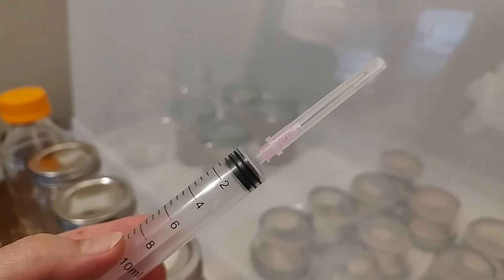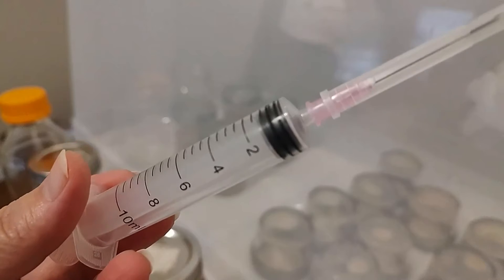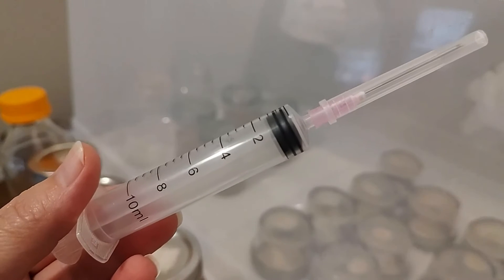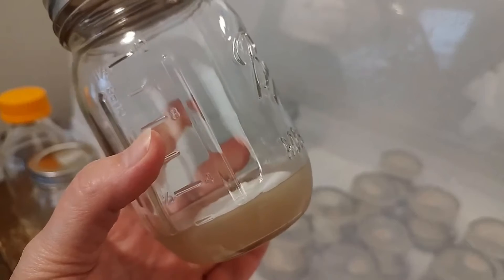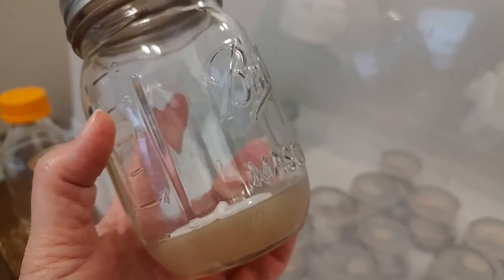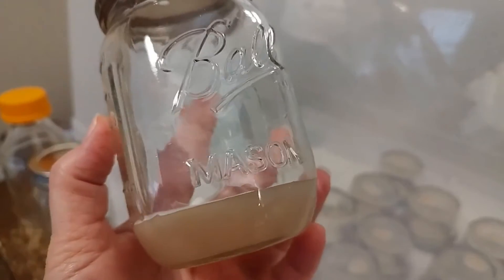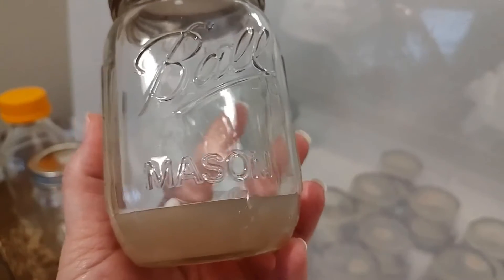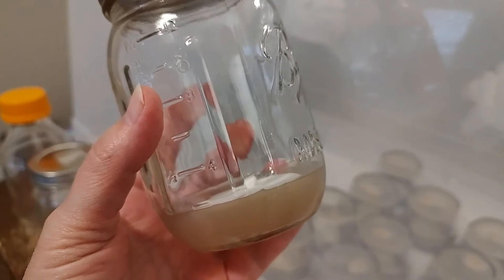No matter how you get your spores — in liquid, in a syringe, or as a spore print you made yourself with foil — you can simply put it to an agar dish, an agar plate, or a no-pour jar and allow your spore to grow out to mycelium. You can also clone fresh or wet fruits. No matter what mushroom you want to grow, if you can get your hands on a fresh version, you can clone it. Whether you have the spores or the fresh mushroom, we recommend converting to mycelium — you're going to be so much happier with the fruits.